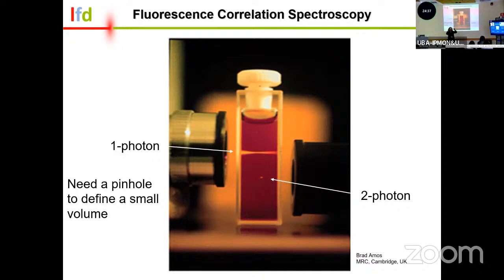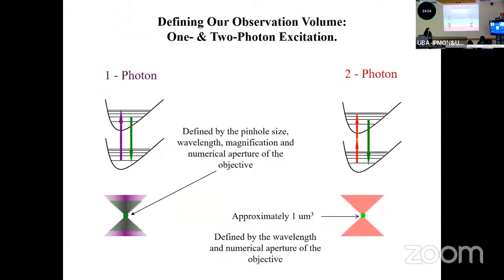We're exciting electrons that are coming from our conjugated ring structure, as Professor Digman showed, that the higher the number of double bonds, right, you're going to use either less energy or more energy to excite those molecules. Okay, so one thing to recall with two photon excitation is the square dependence of light intensity, the probability of exciting the molecule goes with the square of the intensity of the laser beam.